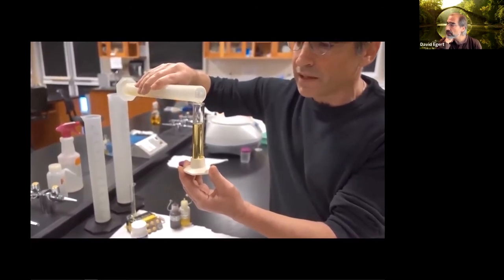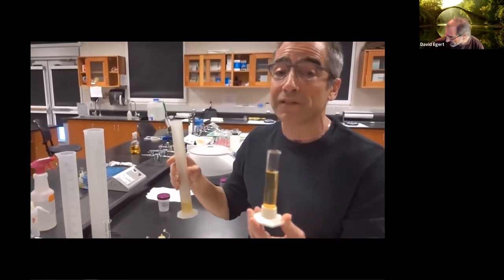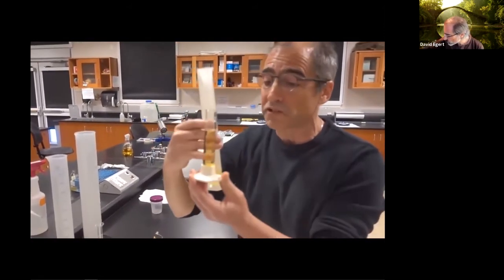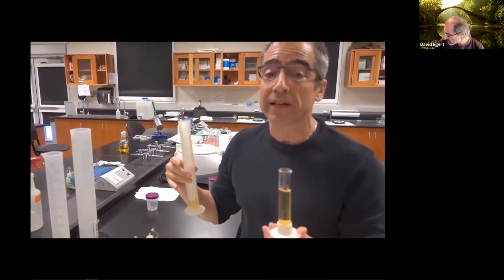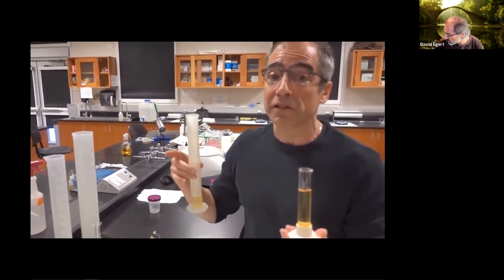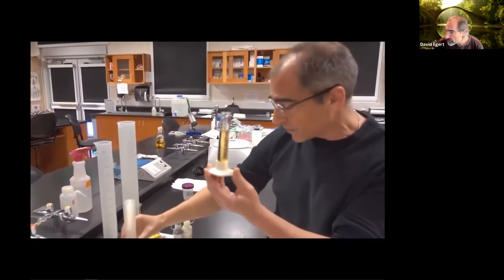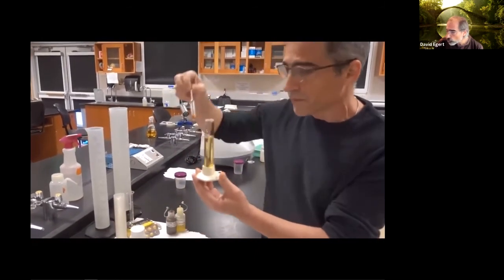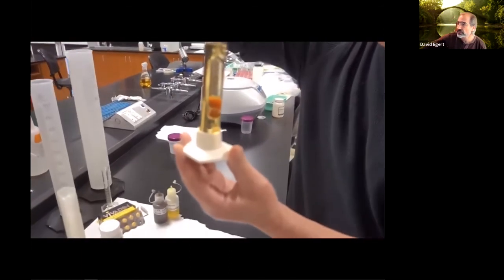If you did not pee at all, you're not going to be able to get a value. And if you didn't get enough urine to actually float the float, you would just have no reading for specific gravity. It wouldn't be 0. 0 is not valid. It would just be null. You don't have a value. But I have enough urine. I'm going to now put my float in, make sure it's not going to overflow. It looks good.